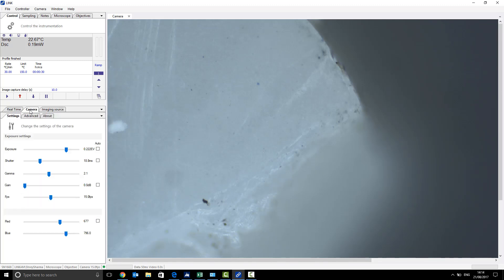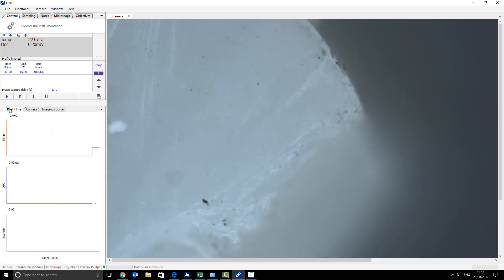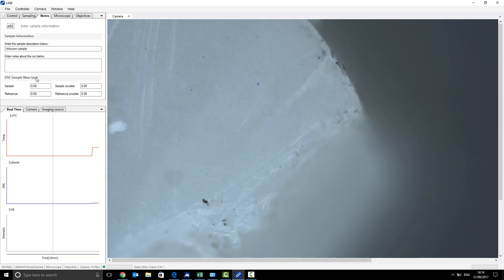Once you're happy with your sample and are happy with the focus, you can then proceed to add the notes.